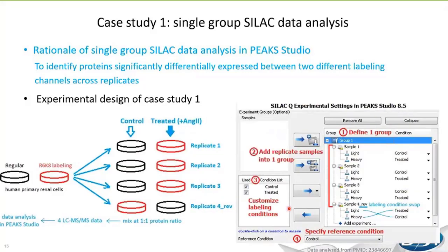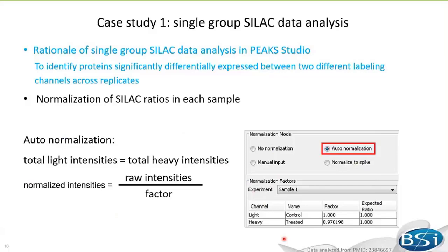According to this design, here is how the experimental settings are configured in PICS Studio 8.5. Two conditions are specified: control and treated. In samples one, two, and three, the light signal is from the control and the heavy signal from the treated, whereas in sample four the two conditions are swapped. The control condition is specified as the reference condition, so that SILAC ratios of treated relative to control are calculated for peptides and proteins.